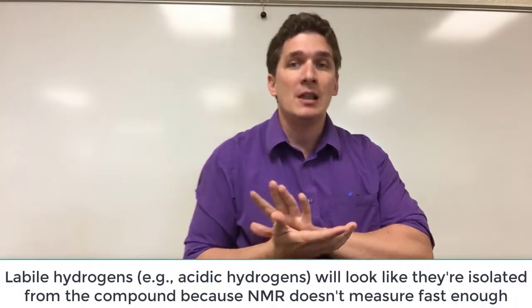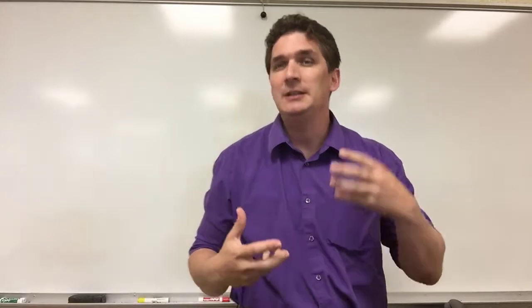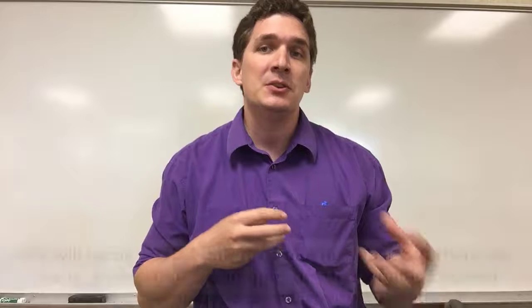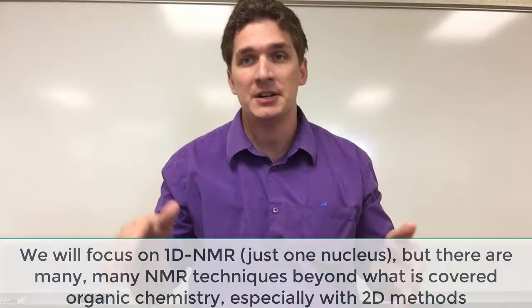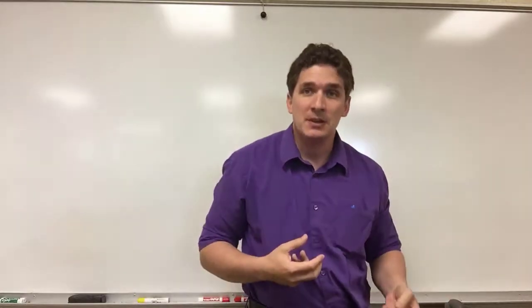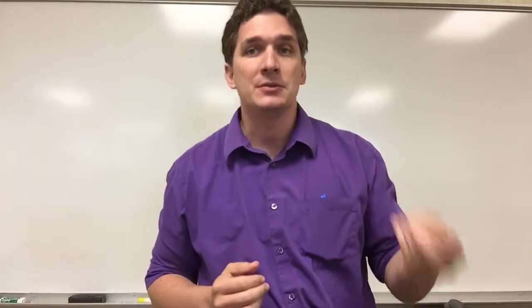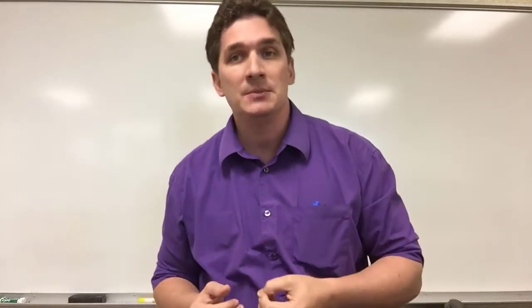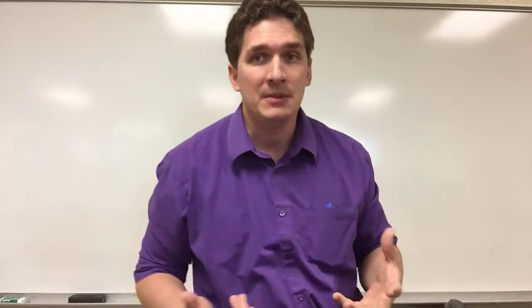Now, there are also a lot of exotic NMR techniques that have been developed over the years to basically make this analysis better. The big ones are NOESY and COSY spectra, and these 2D NMR plots where we look at carbon 13 versus 1H hydrogen. These are very useful plots. Unfortunately, they are what's considered expensive techniques. They take hours and hours to run versus a carbon 13 or 1H NMR. The 1D NMRs are cheap and take maybe 5 to 10 minutes.